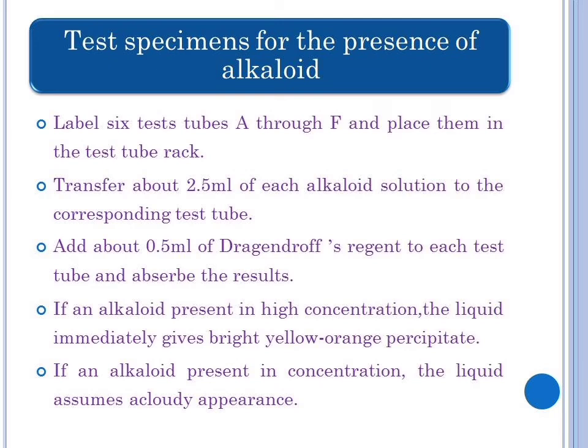If you have an ultraviolet light source available, you should always use it first to visualize the chromatogram, before chemical methods such as Dragendorff's reagent or iodine fuming. Many colorless analytes, including some alkaloids, fluoresce under UV light.